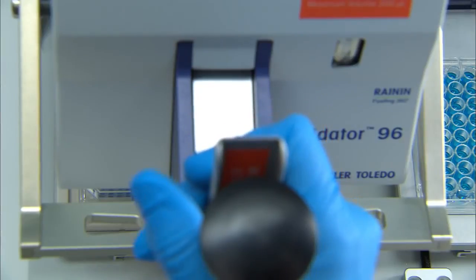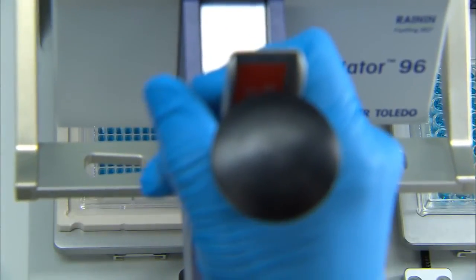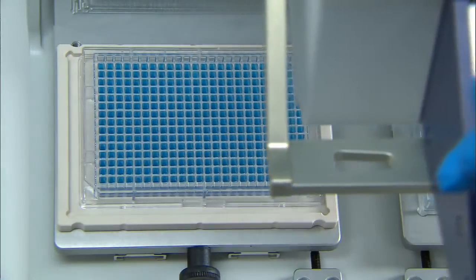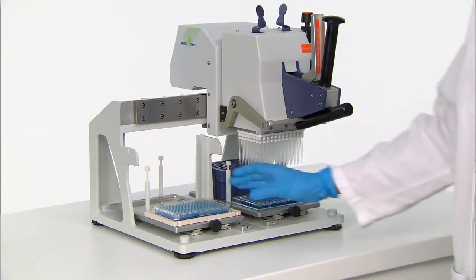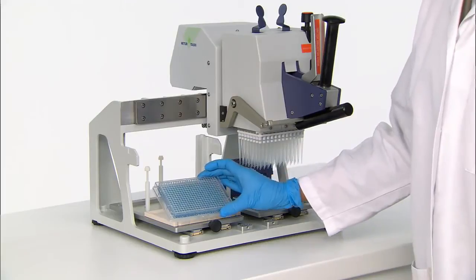As we've seen, there's virtually no setup time. Plates can be filled without much preparation anywhere in the lab or outside the lab, since neither a computer nor electricity are needed to run the system.